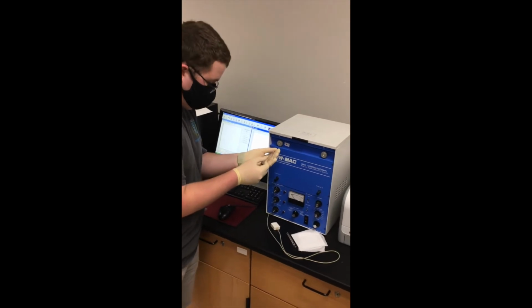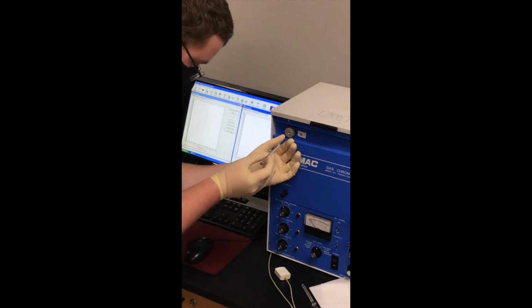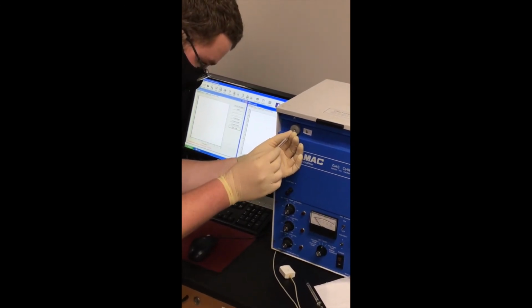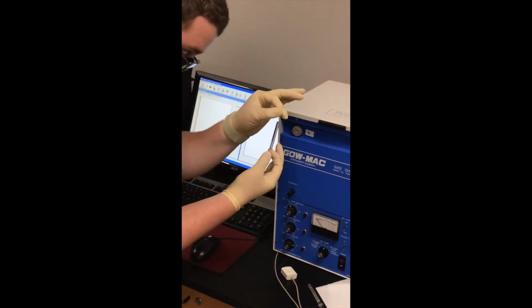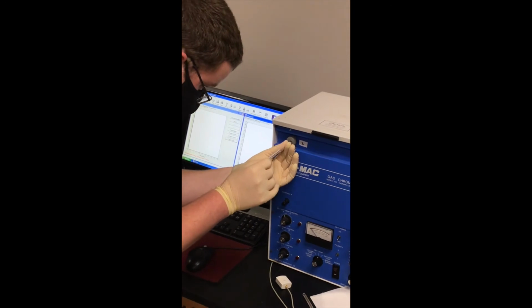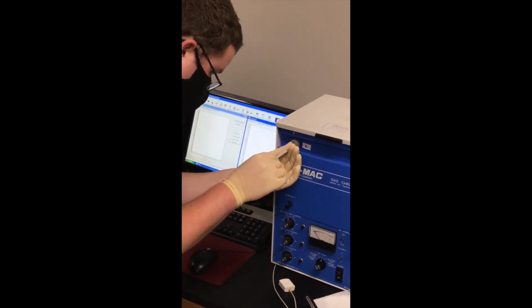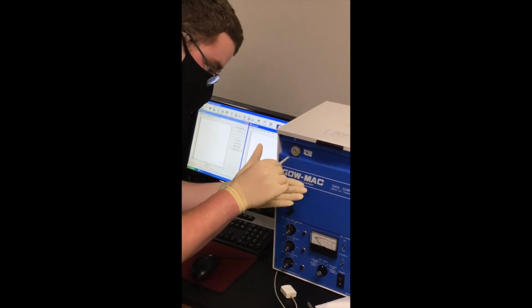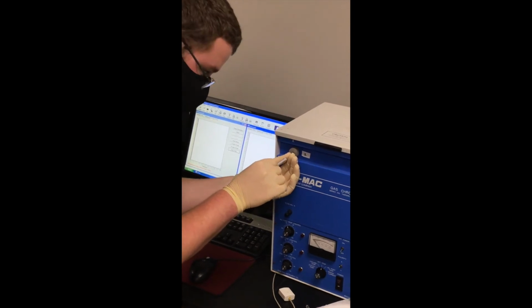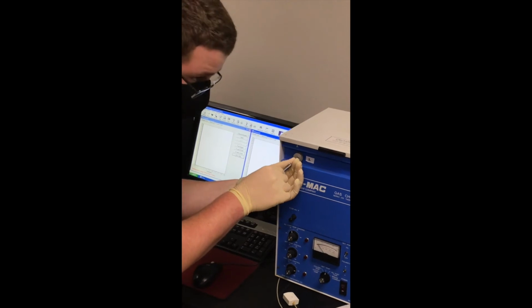What I normally do is I'll take two hands, and I will rest my left hand, in this case I am the lefty for this, on the GC, and then I will push this syringe through my fingers. I don't know if you can see the needle through, but I've already got my fingers wrapped around the needle. I will hold my fingers right up next to the nozzle, and I will slowly push it in while holding it as straight as possible. You can't do it like this. You have to have some kind of hand on the needle, otherwise you will break the needle with as little force as possible.